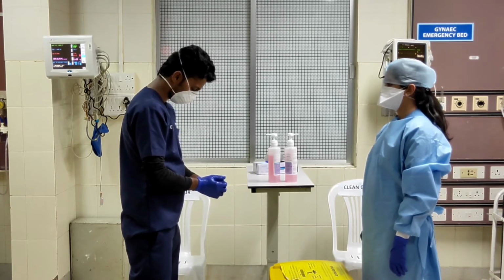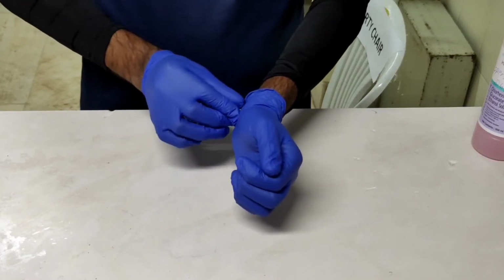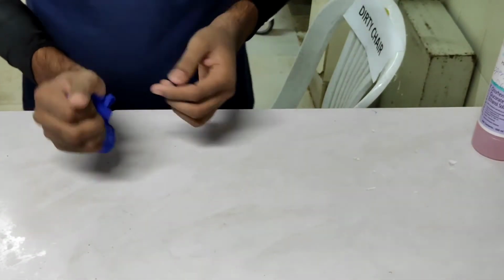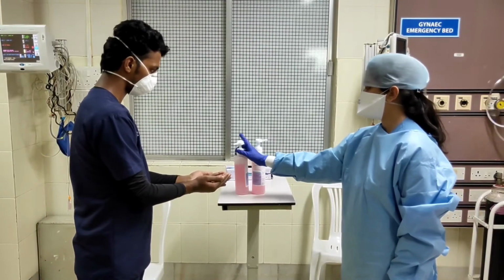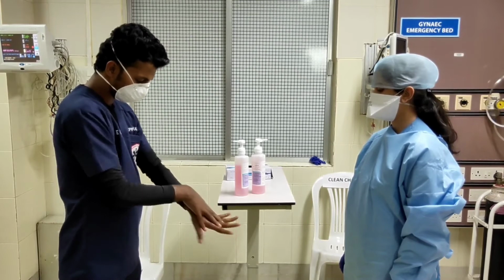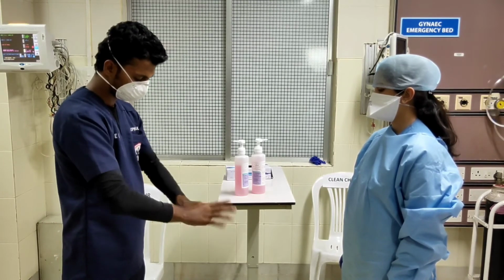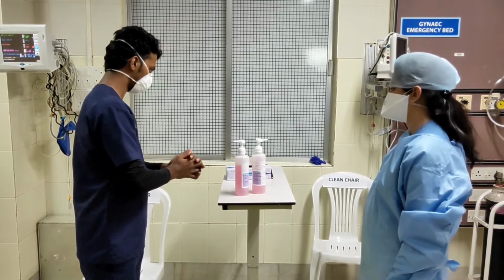Once the sanitization is complete, the inner gloves can now be removed and discarded like how we did with the outer gloves. Again, disinfect your hands properly. After disinfecting your hand, you can now put on a new pair of gloves.